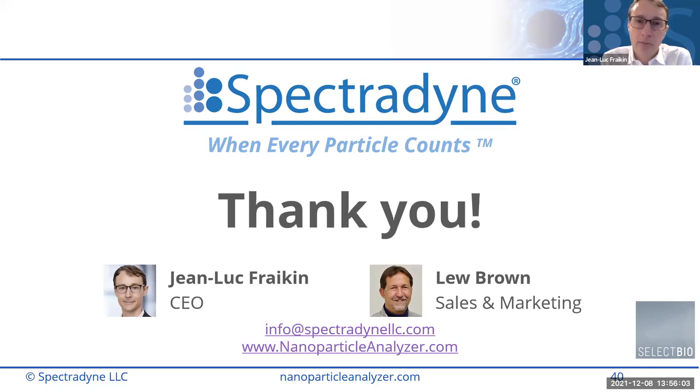It's the number of particles in a given size range divided by that measured volume. So if you're measuring a different concentration, either the flow rate's the same and the number of particles is different, or the number of particles is the same, but the calculated volume is different. And it's going to be sample dependent. So I think maybe we need to work more with you on the sample prep, the method development stuff.